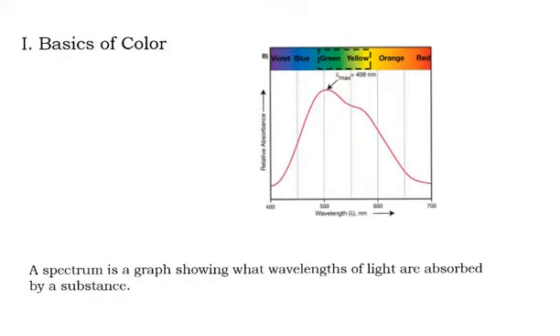So in that you would take your sample, you would put it in, and you would measure its absorbance at say 400 nanometers. Then adjust the spectrometer up to 410 nanometers and take another absorbance reading. Then adjust it to 420 and take another absorbance reading, and so on every 10 nanometers till you get up to the top of the spectrum at 700 nanometers. And then plot that data, and you would see a diagram that looks something like this.